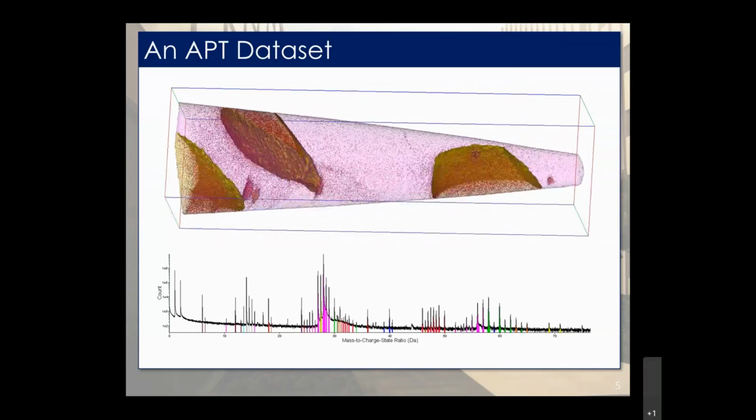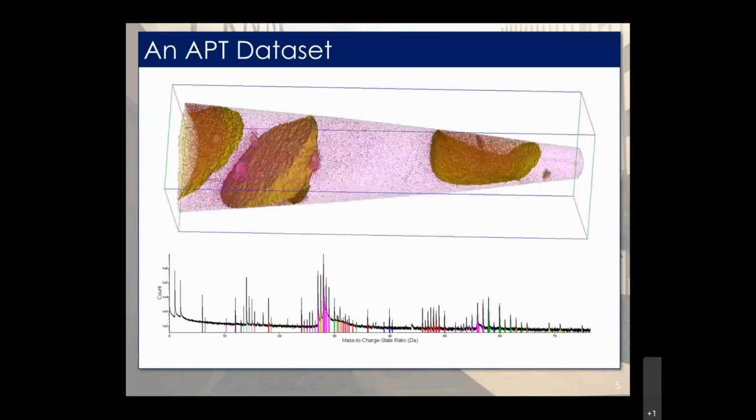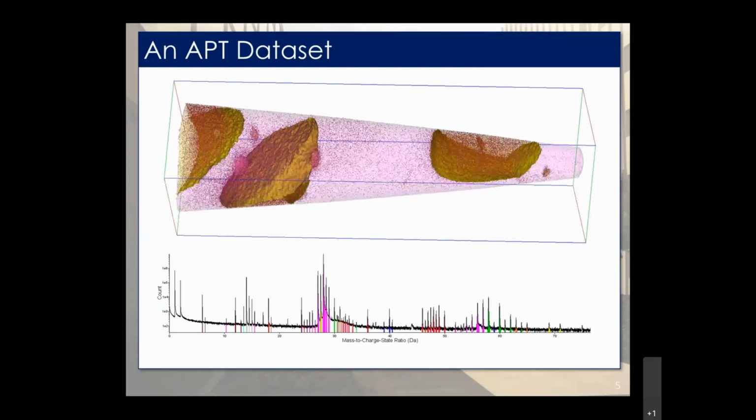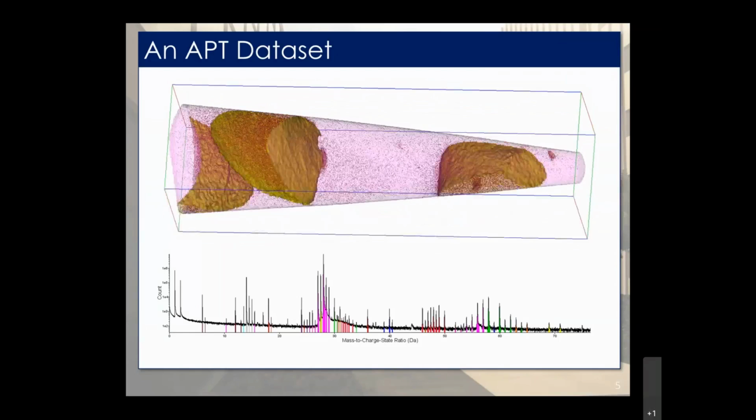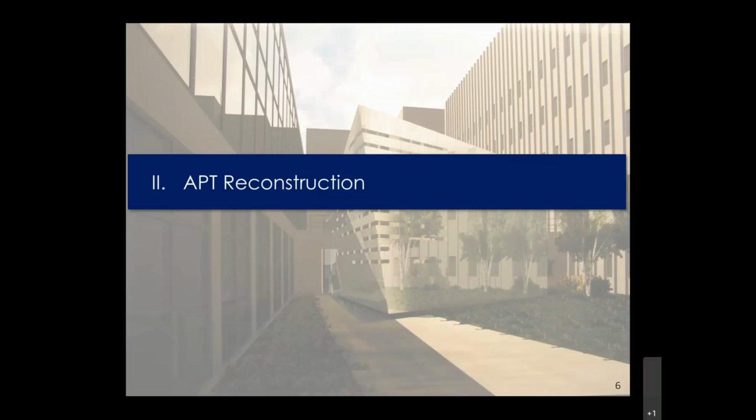But always keep in mind, you're making these observations on the model you make with the reconstruction. So every step of the whole process is important, the reconstruction quite critical. Let's go into the details of a reconstruction, how you make it, and what are some of the factors that can separate a good reconstruction from a bad one.